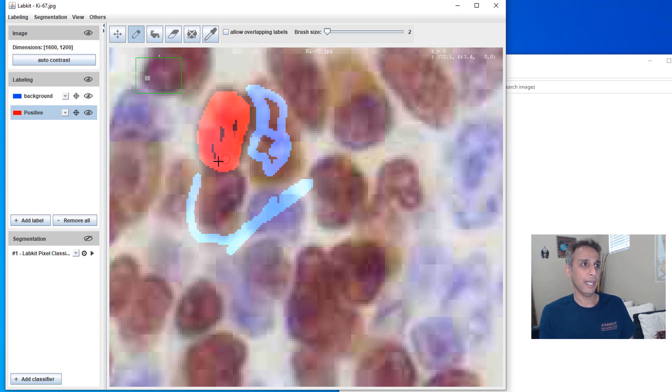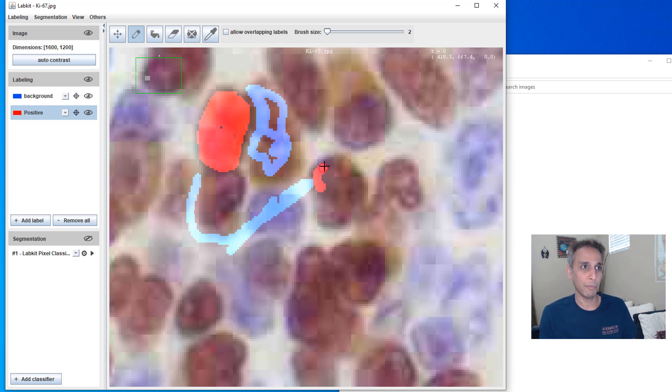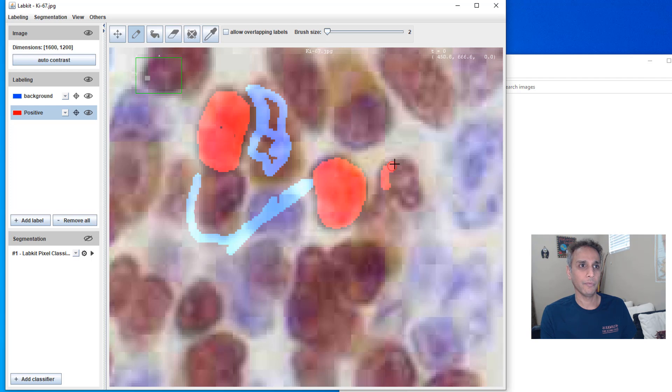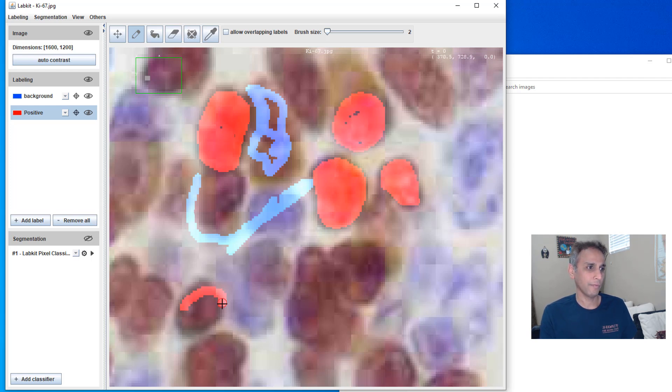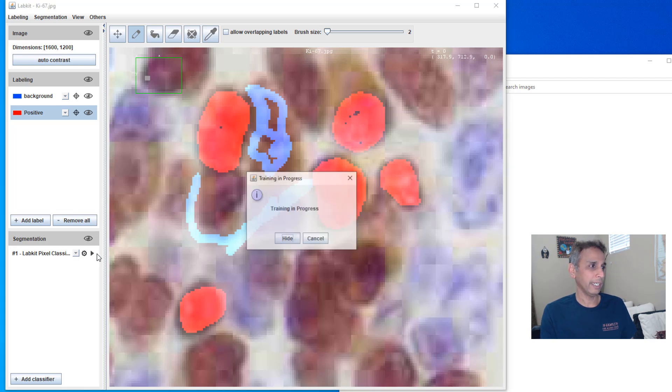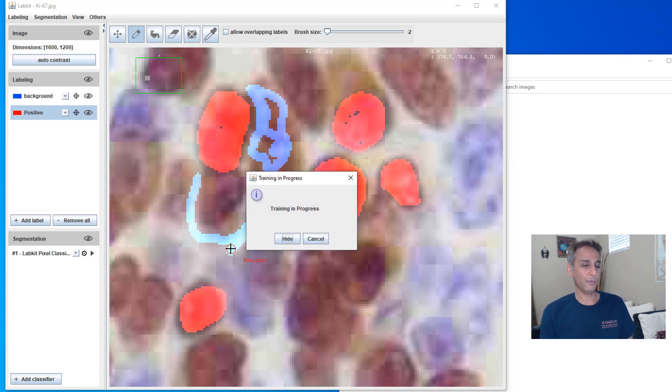I'm going to add a few more of these regions and you can add a few more positives also. If you think some of the positives are not being classified correctly, go ahead and add the positive pixels. Let's do this one more time.